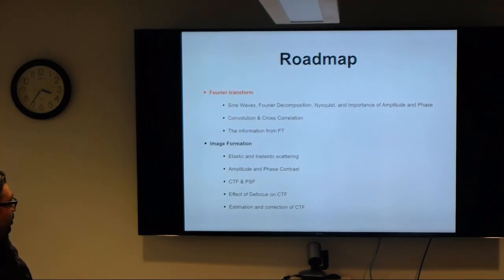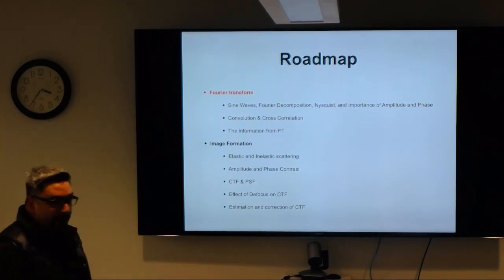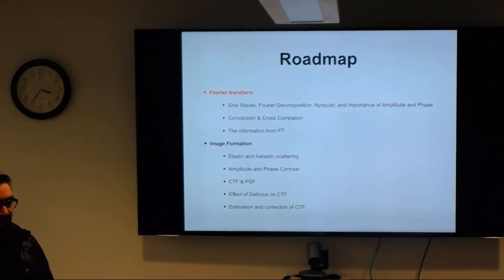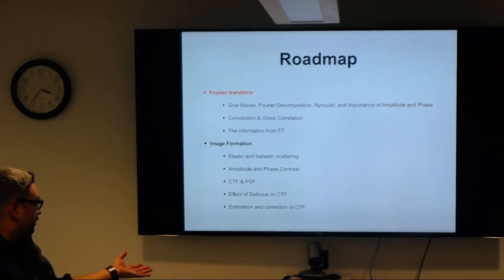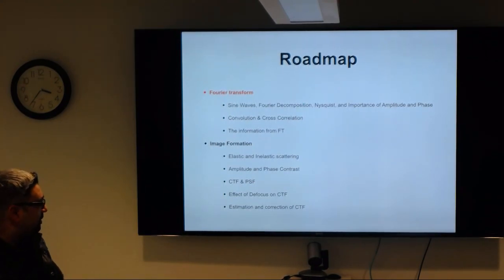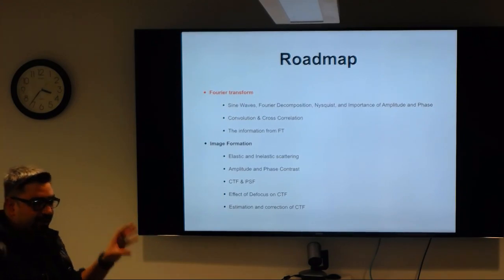And I will move forward and talk about image formation, elastic and inelastic scattering, amplitude and phase contrast, the CTF, PCF, or PSF, the effect of defocus on the contrast transfer function, and then a little bit about estimation and correction.